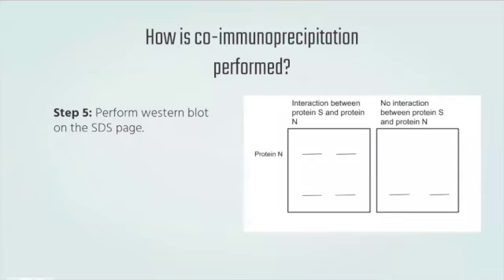After the SDS-PAGE, a Western blot was performed in order to visualize the bands that represent the proteins. The anti-N antibody was added to the pull-down fraction.